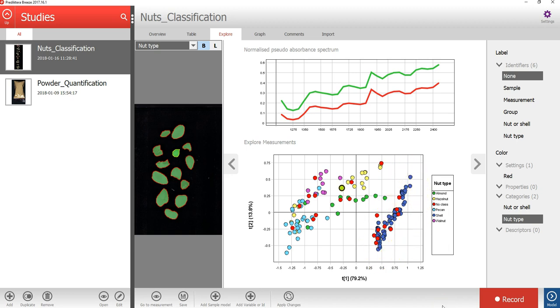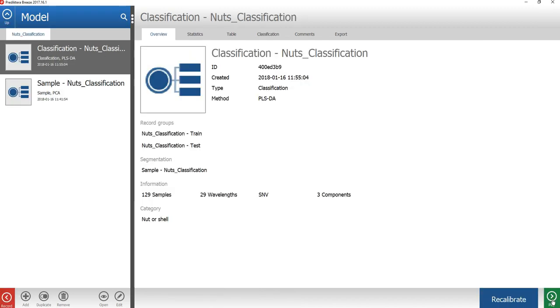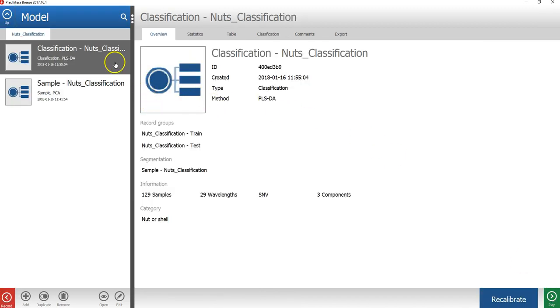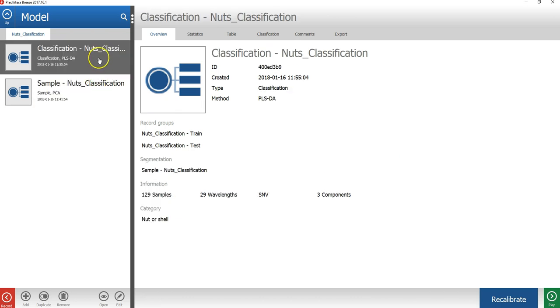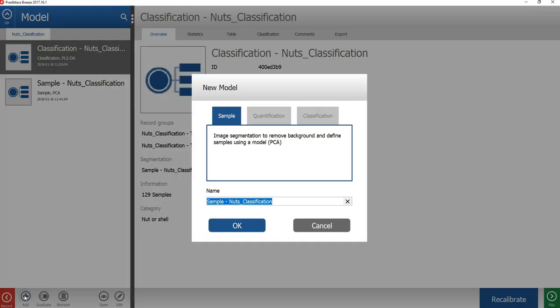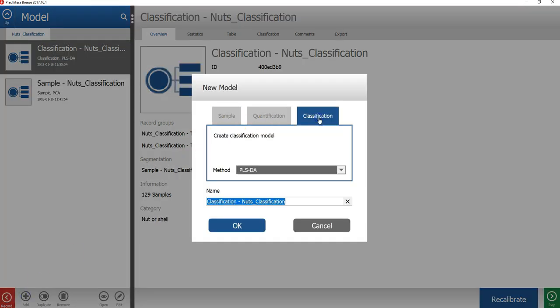Let's create a classification model for the nut type variable. To do that, I will press the model button in the lower right corner to come to the model view. Here we have the sample model that we had created in the previous tutorial, and the classification model for nut or shell. I will press the add button in the lower left corner to make a new model. I will select the classification tab and PLSDA. I will then write a name.